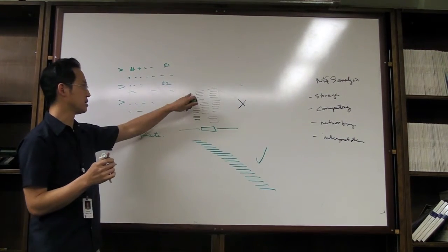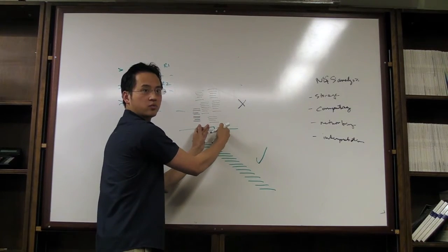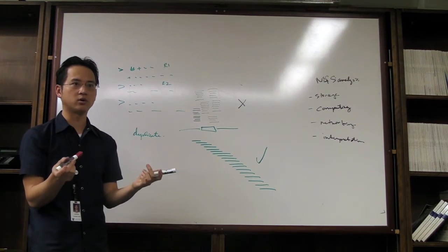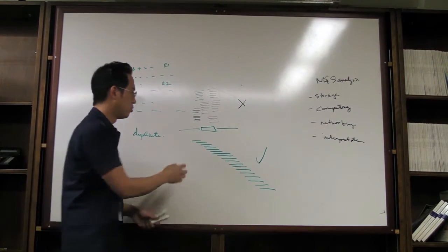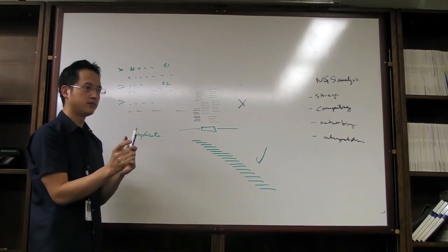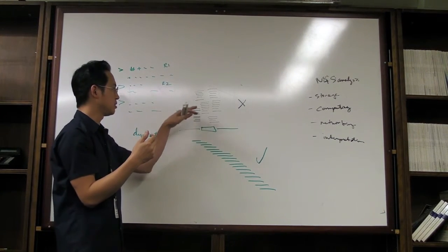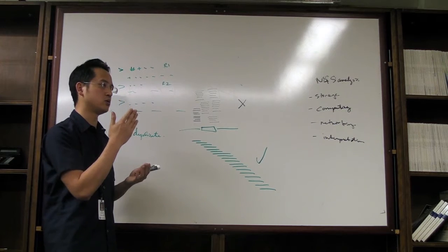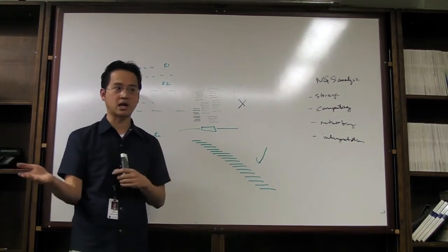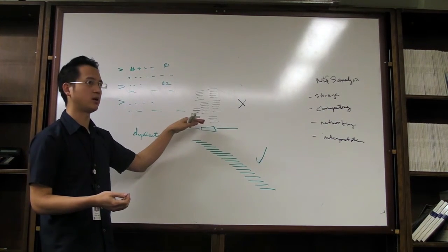In a PCR-based assay, you're going to get this no matter what, right? Because I'm only targeting one amplicon versus my target. But in a shearing-based method where you're doing whole genome library construction and then you're doing capturing, you want some representation like this. Because this means that you sheared randomly, your library ligation was random, and the PCR enrichment steps that you perform prior to capture at the end of library construction, and the one that you perform after capture to do enrichment, were not biased and were complex.